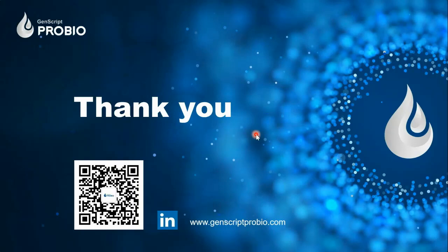I think most of the recoveries are lost during the purification process, which again has to be optimized. We have to use different design experiments to see which filters we are going to use and what the recoveries are for those. For example, you get higher recoveries when you're using a cellulose filter. When it comes to PES, then you might get a lower recovery. So you have to optimize depending on your project.